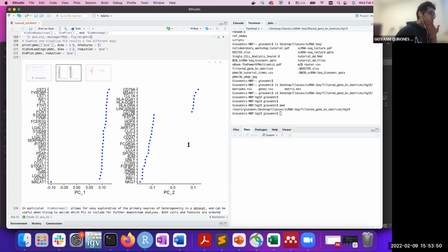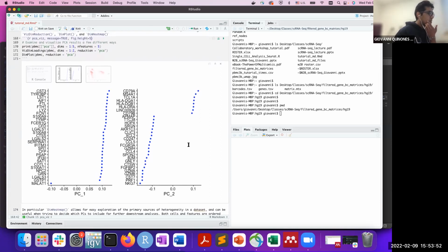I don't think it's too relevant whether they're positive or negative, because it's not easy to interpret. So we understand this is a new coordinate system. It also represents a meta gene, which is a combination of the values of other genes. But it's not very intuitive to analyze what it means to have a positive or negative PC, and it's not information we'll use later on.